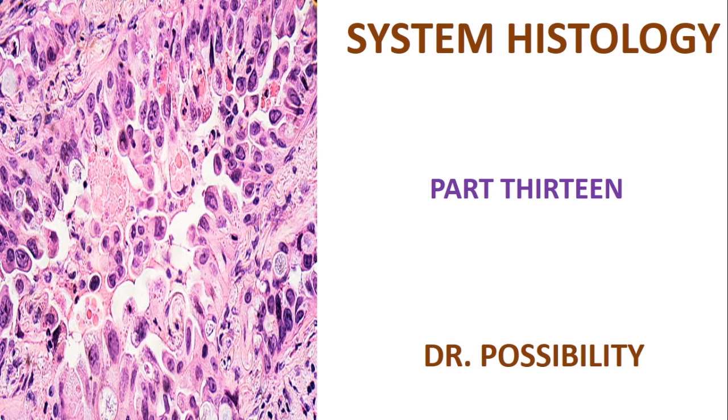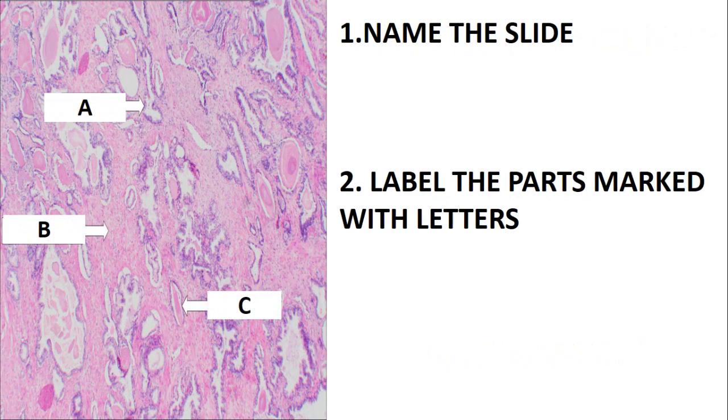In this tutorial, I'm just going to explain part 13 of system histology. So please make sure that you watch my part 1 to part 12. Let's quickly look at some few slides. So the first question is, name the slide.